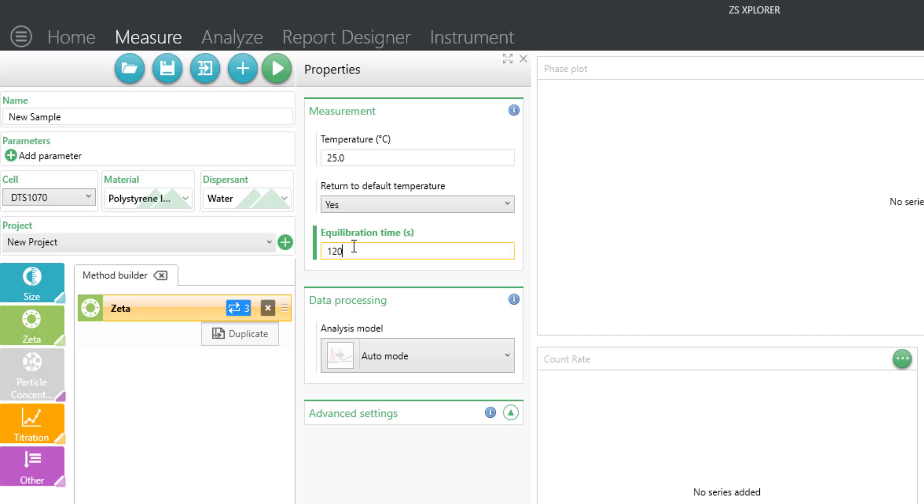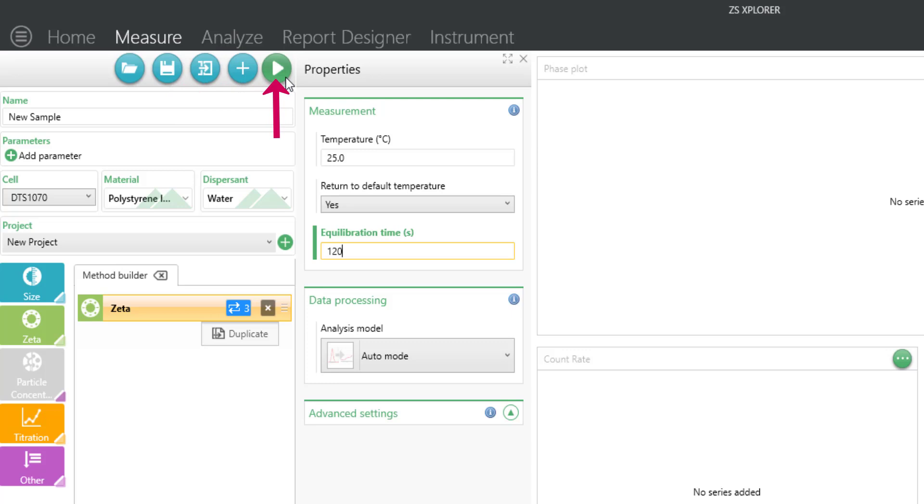Equilibration time can be adjusted up or down depending on the temperature difference between your sample and the desired measurement temperature. You can save the method for future use or simply insert your cell into the instrument and start the measurements.